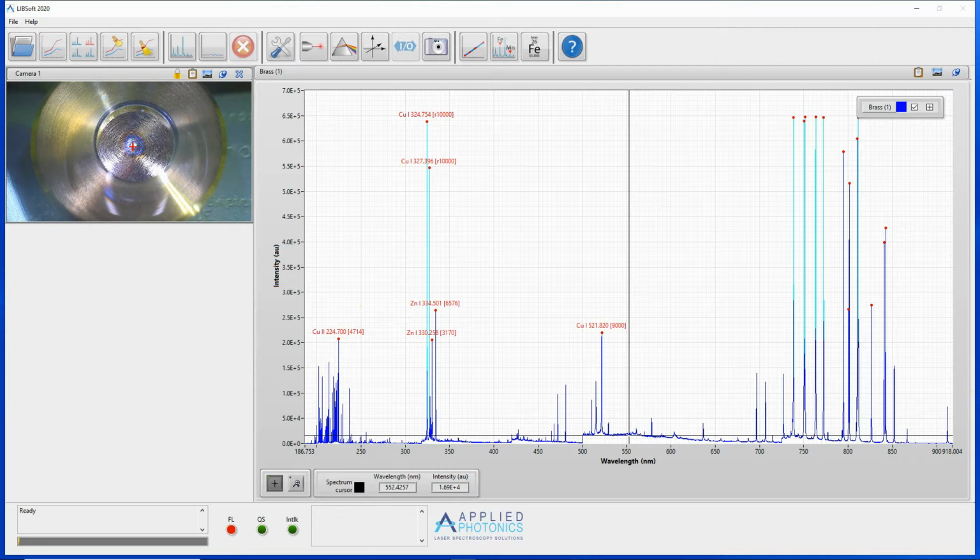Note that for online identification, a peak threshold value is automatically calculated based on the acquired spectral data in order to identify a reasonable number of the most intense peaks in the acquired spectrum. The software attempts to set a threshold value such that at least 5 peaks are identified if possible, but the maximum number of peaks identified is limited to 20 so that the spectrum display does not become too cluttered.